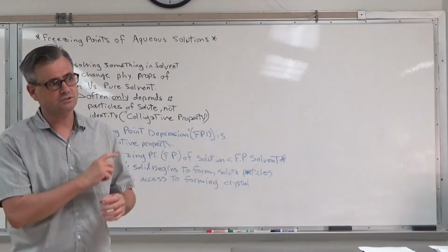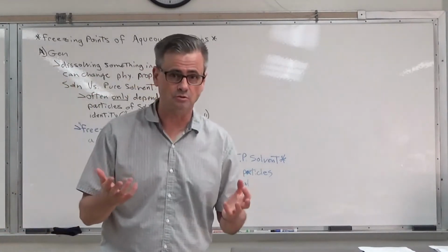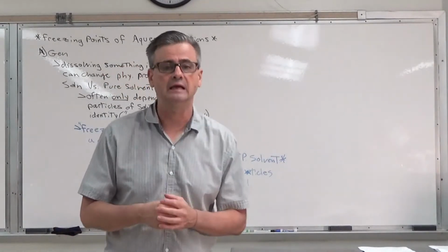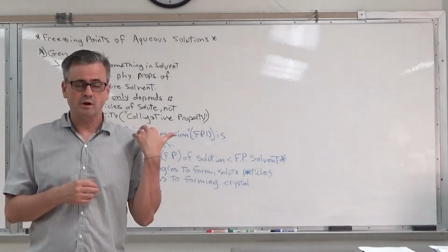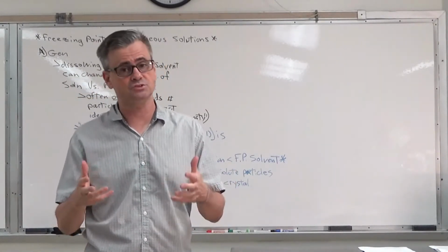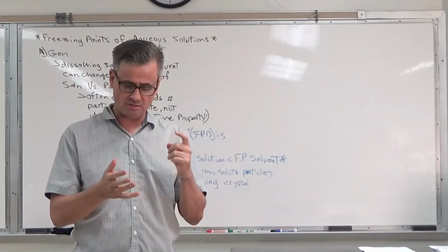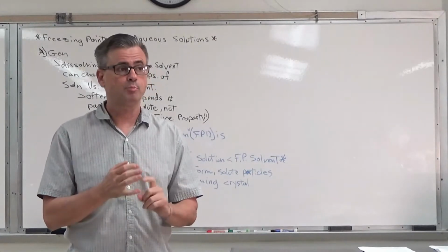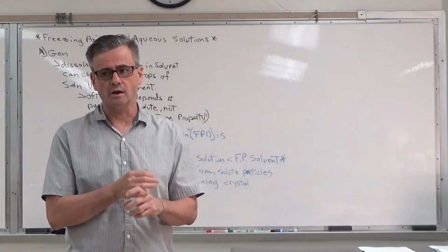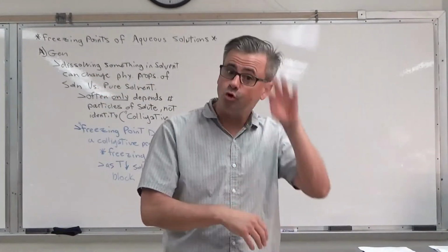The concentration term we're going to use is a little bit different than what we've used in the past. We've mostly used molarity for concentration, moles per liter. For this, we're actually using something called molality, which is very similar to molarity. It is defined as the moles of solute per kilograms of solvent, whereas with molarity, it's moles of solute per liter of total solution.